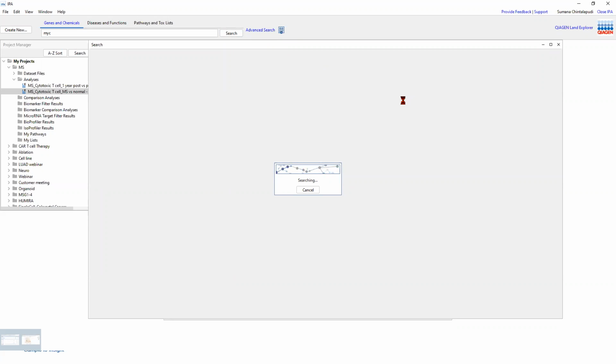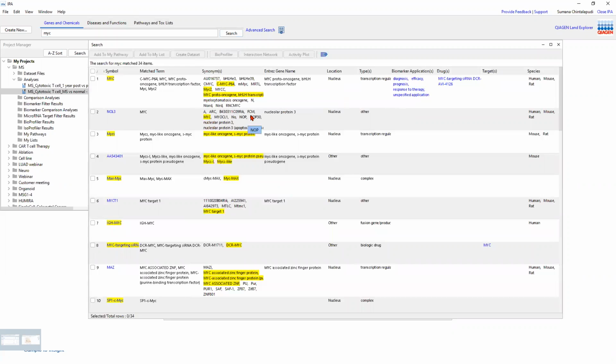So can the user tell me if the .1L, if it was not phosphatase, what it was? It's interesting that it shows up as phosphatase in our system. I can make a note of it and then see if it was the case or not.